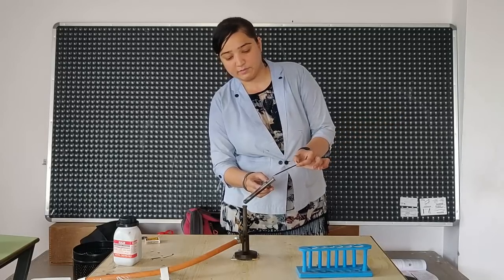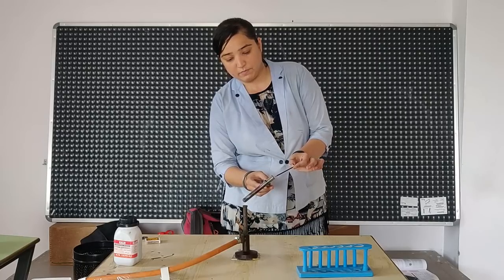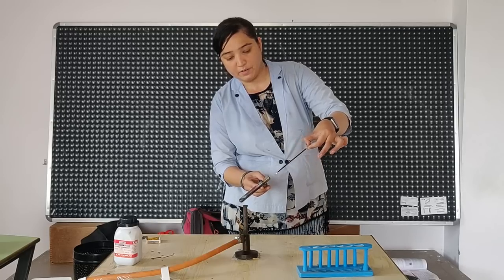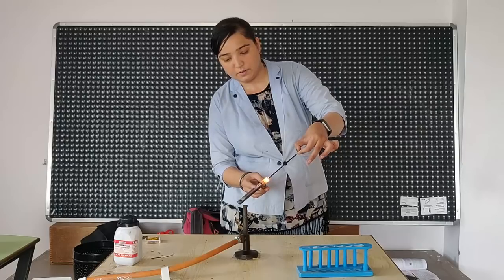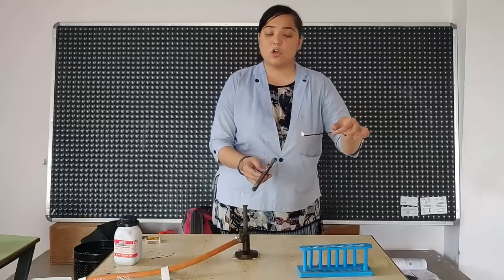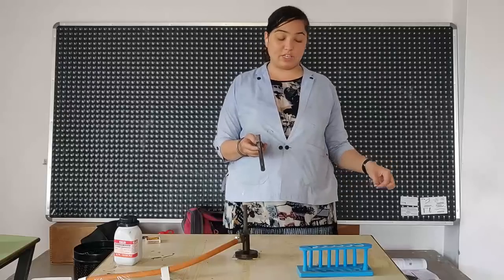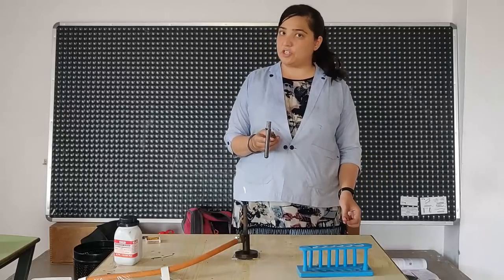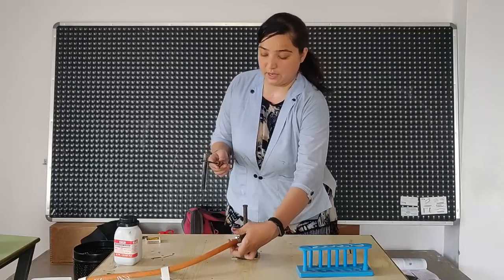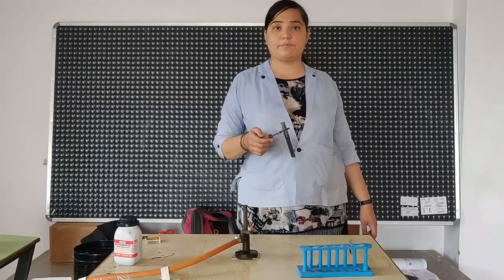Once again, now near the mouth, let me dip it. See, that is because oxygen is supporter of combustion. Potassium permanganate when heated, we get oxygen. So this is about the formation of oxygen. The whole of the theory of it we are going to study now.